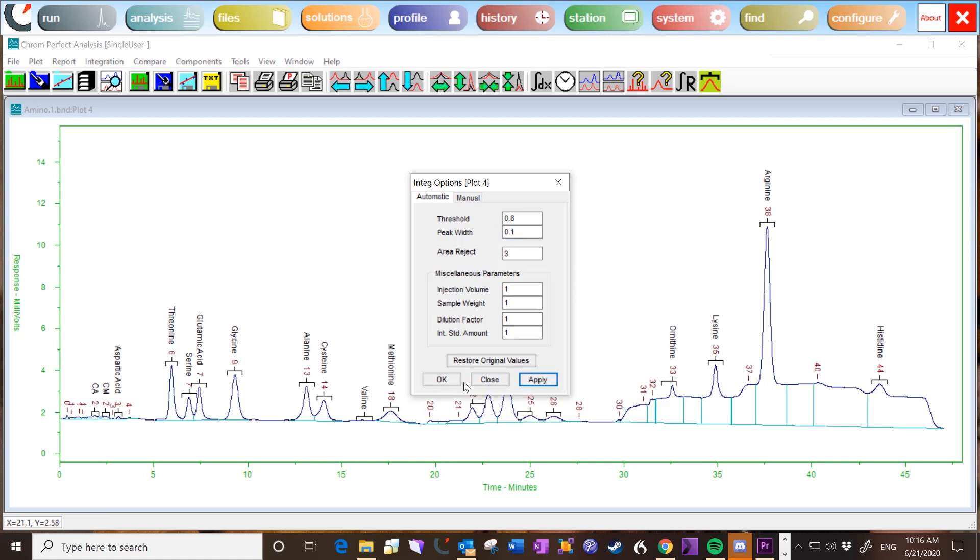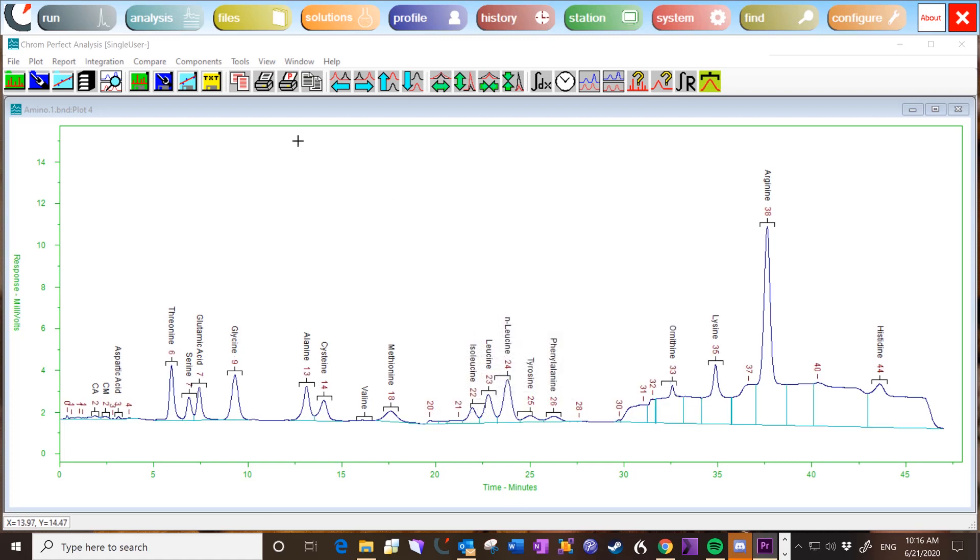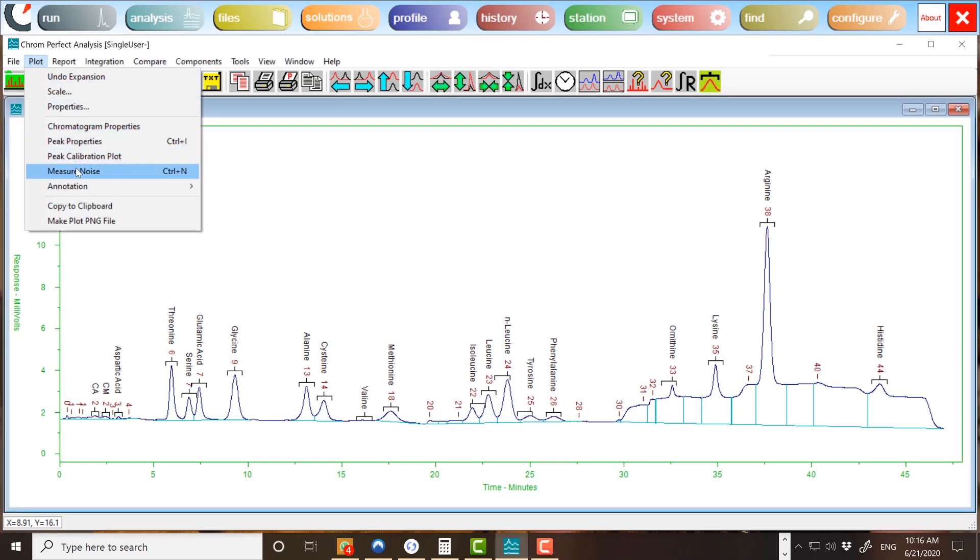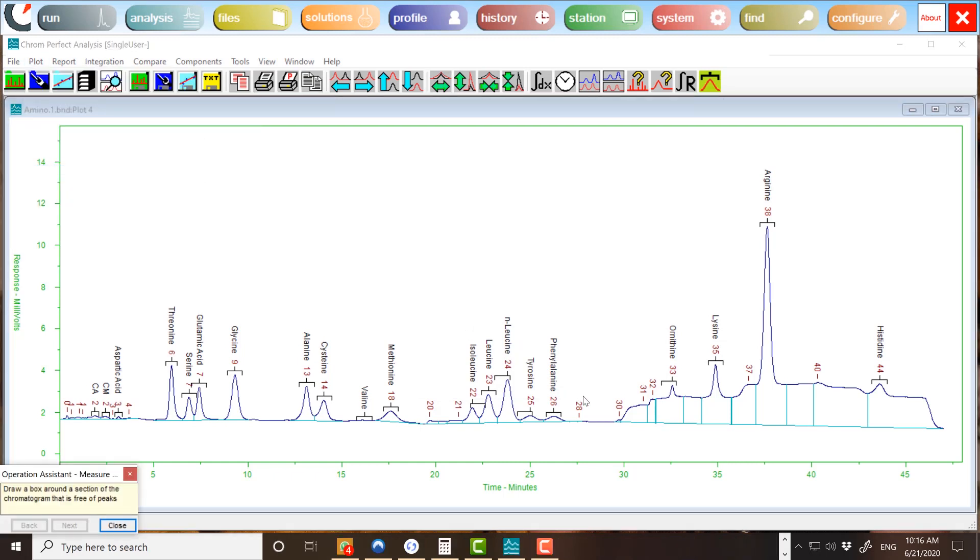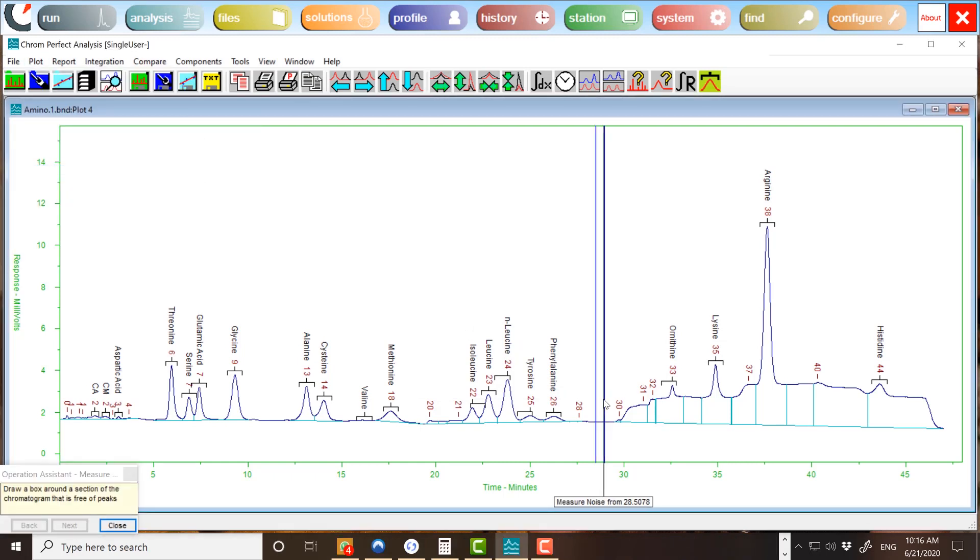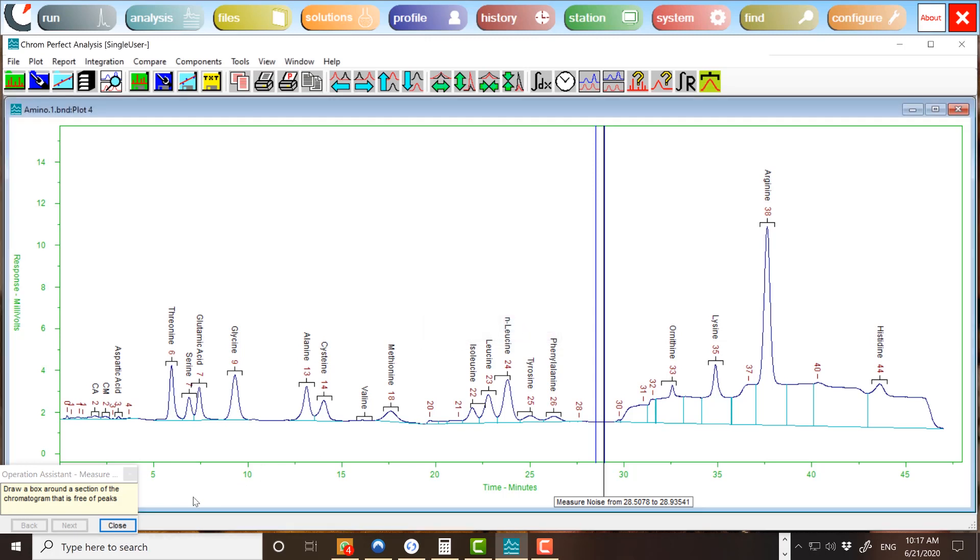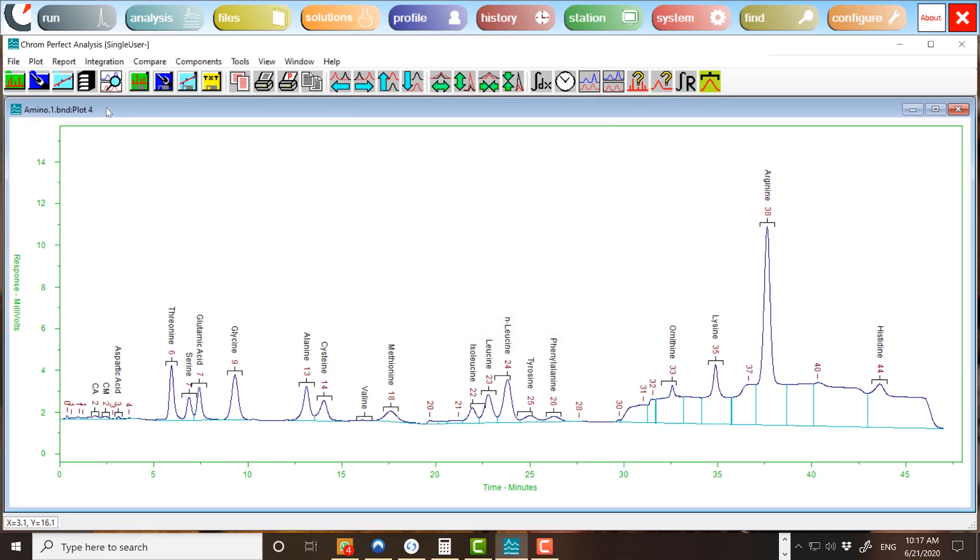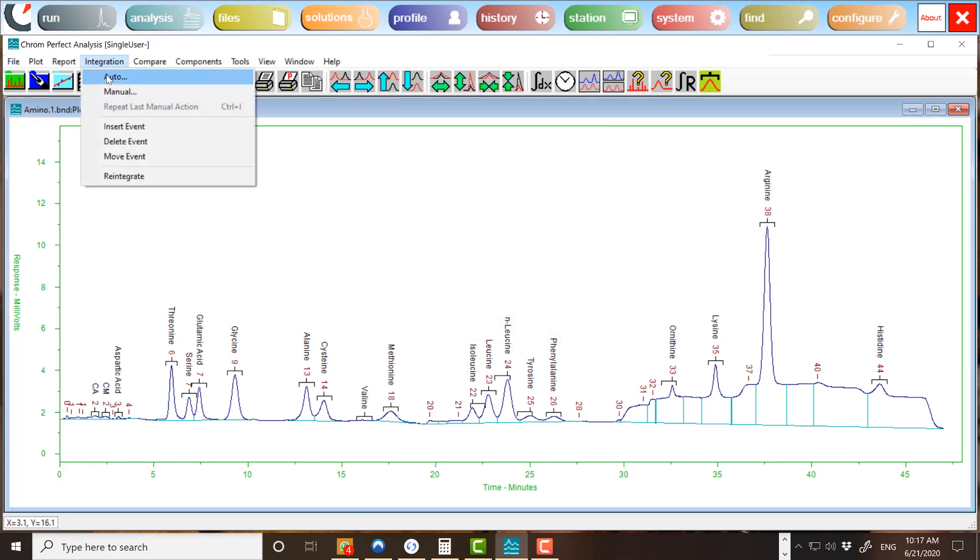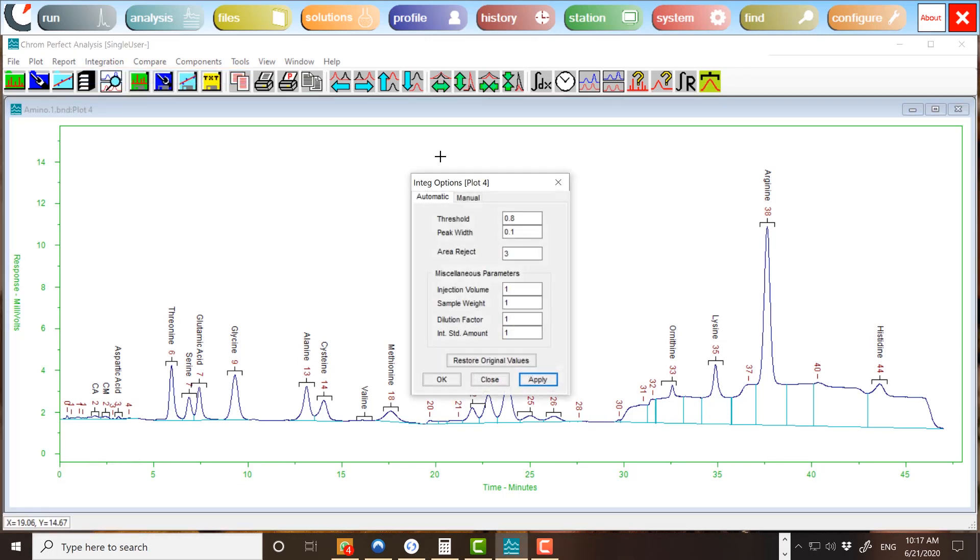The Measure Noise tool within the plot menu can be useful for getting a rough idea of the threshold settings. Measure the noise in a flat area of the plot and a threshold value will be suggested. If you wish to use the suggested threshold value, you will need to enter this number manually.